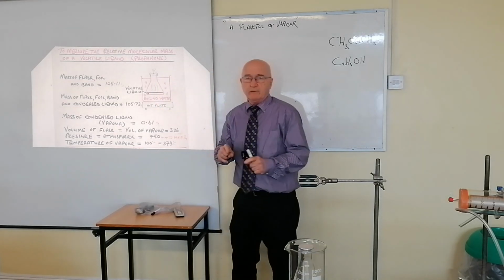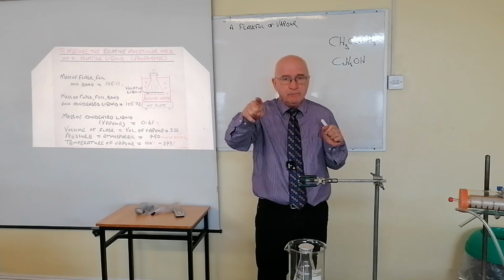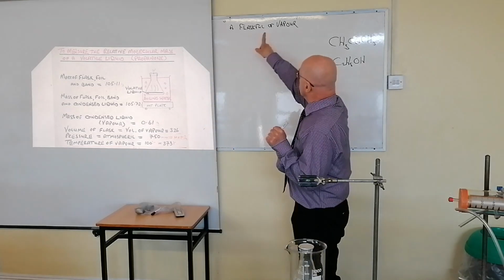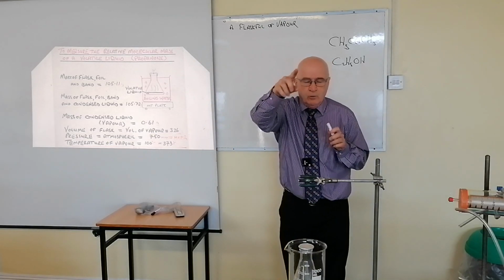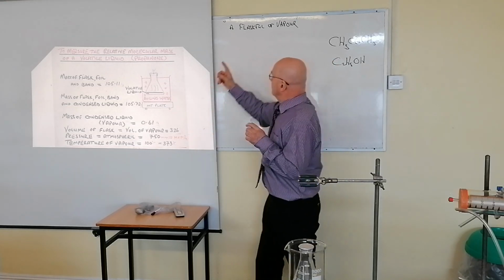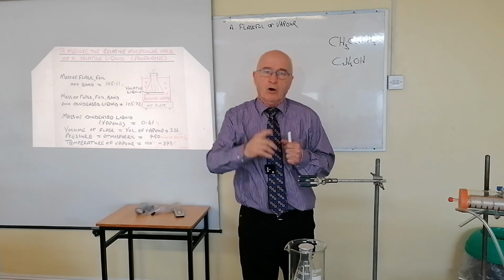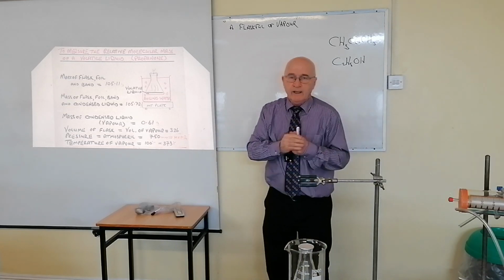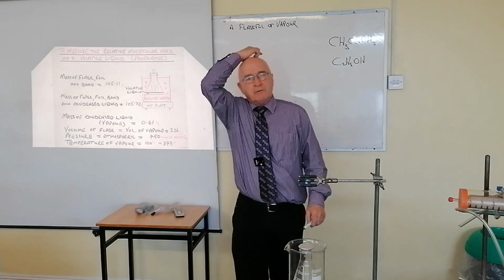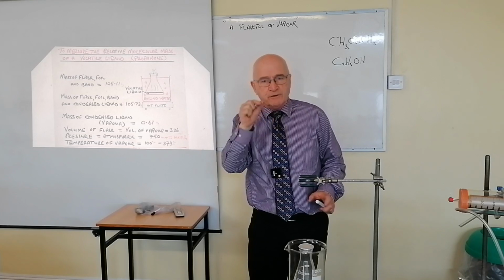But you're watching this liquid. As the liquid gradually disappears, you're watching it very closely. And at one point along the way, it's going, it's going, it's gone. The moment it's gone, you have a flask full of vapor. What could happen there? If it wasn't all gone, then you'd have a flask full of vapor and some liquid left over. Or if you left it there too long, you would not have a flask full of vapor, because some of the vapor would have escaped through the pinhole over a period of the extra time. So it's very important, your judgment here.